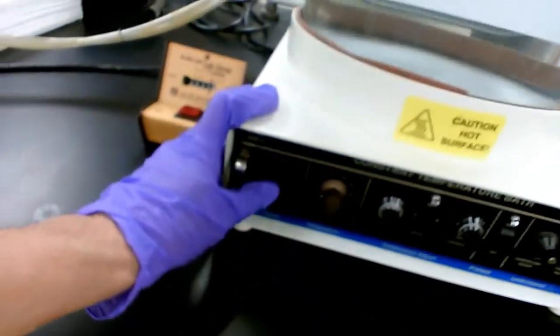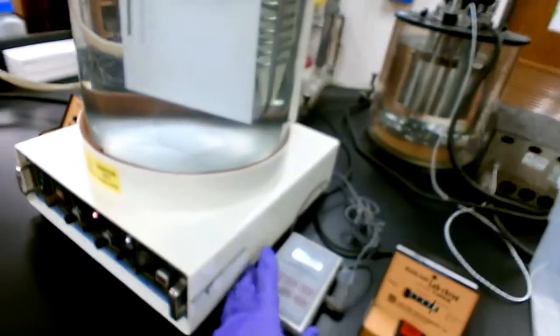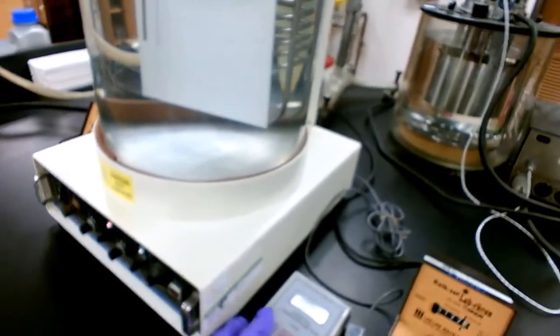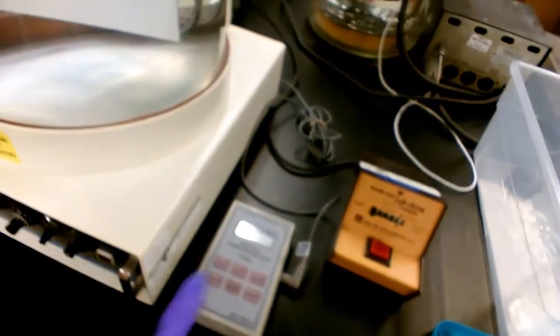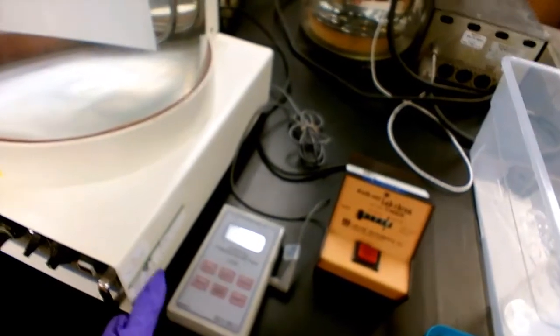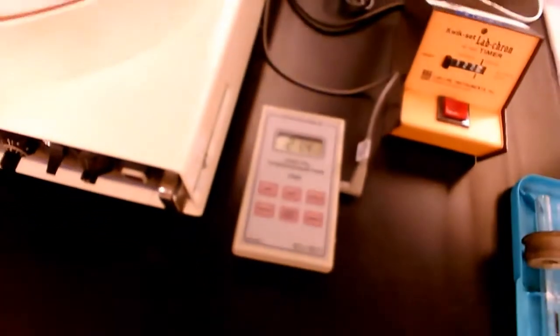The water bath can be turned on using the main switch. Next, you are going to turn on the thermometer. I prefer centigrade, so I'm going to select centigrade. Right now we are seeing a temperature of 21.4°C for this water bath.